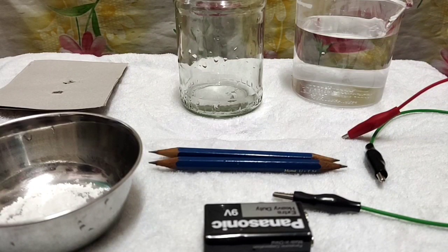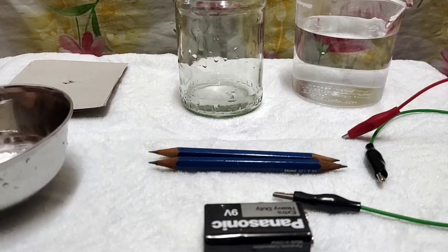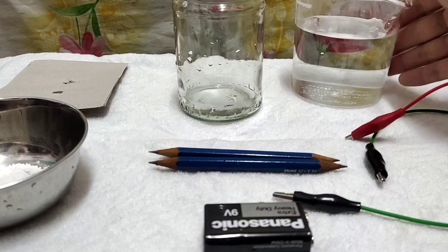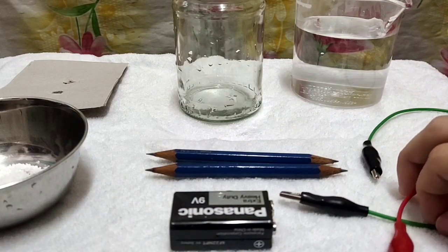My name is Esther and today I've been carrying out two experiments, which are the electrolysis of water and the electrolysis of copper(II) sulfate. I will start off with the electrolysis of water, and here are my apparatus and materials. I have a cardboard with two holes, my NaCl salt, a beaker, 250 ml of warm water, 2 pencils, one 9-volt battery, and 2 crocodile clips.